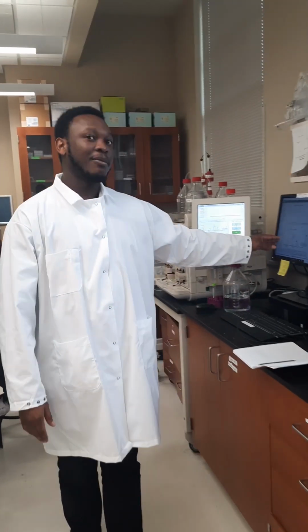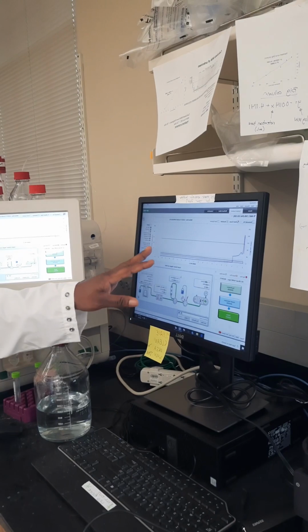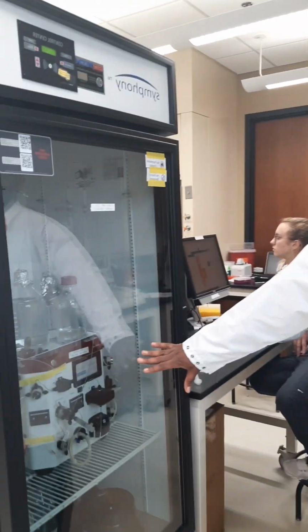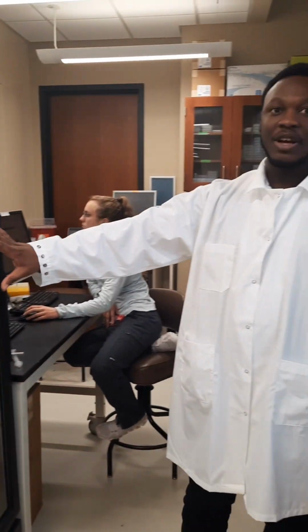This is our size exclusion chromatography, and basically we use it to achieve purification of our protein. So if our protein is present, we are going to see a sharp peak here. This is also a size exclusion chromatography machine. The difference is just in the column. So it depends on the size of our protein. It helps us to know the column to use.